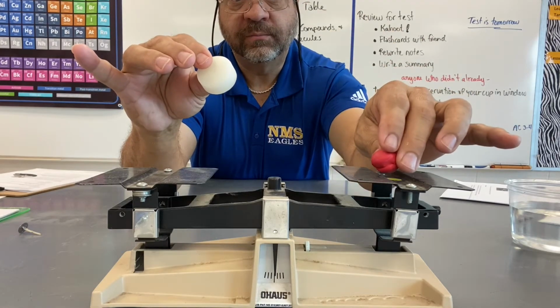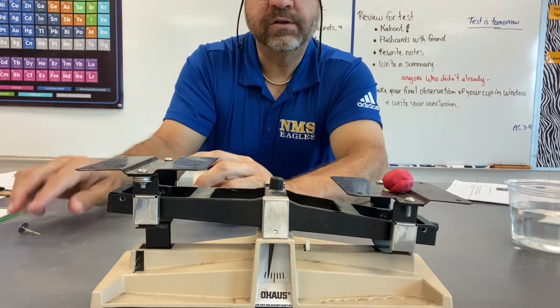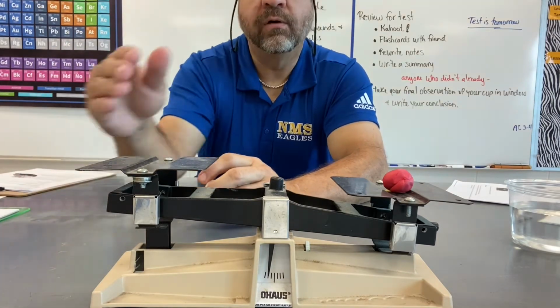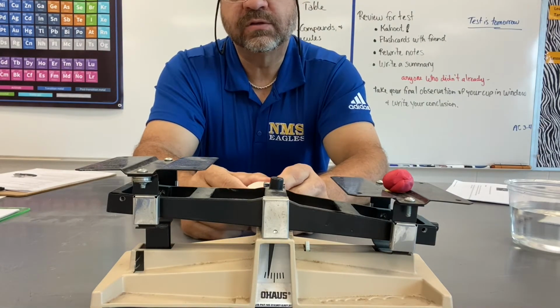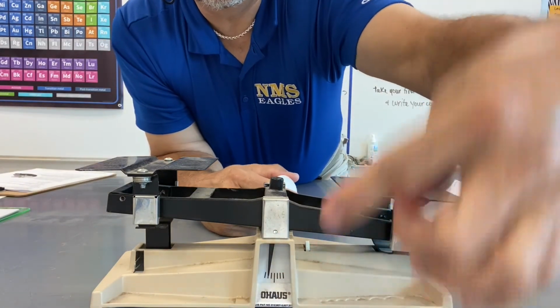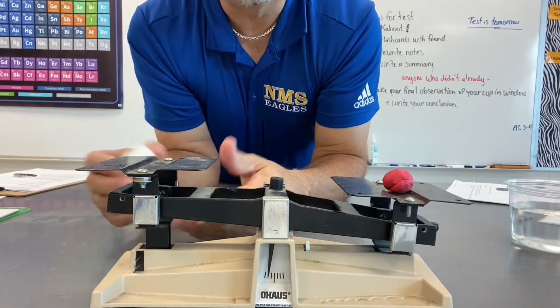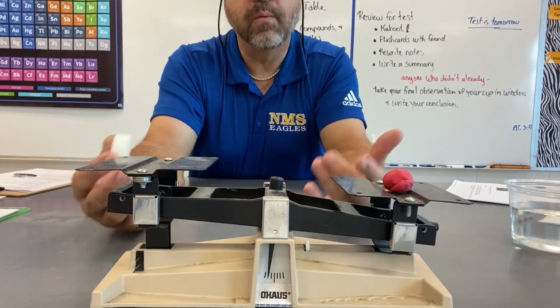I'm going to set the clay on my balance here. You might have used a balance before, but just in case you have not, all this is showing us is which one is heavier. It's not giving us an actual weight. So you can see down here, there's the scale, and it's not giving us grams or anything like that. It's just which one of these is heavier. It is literally a balance, like a seesaw.